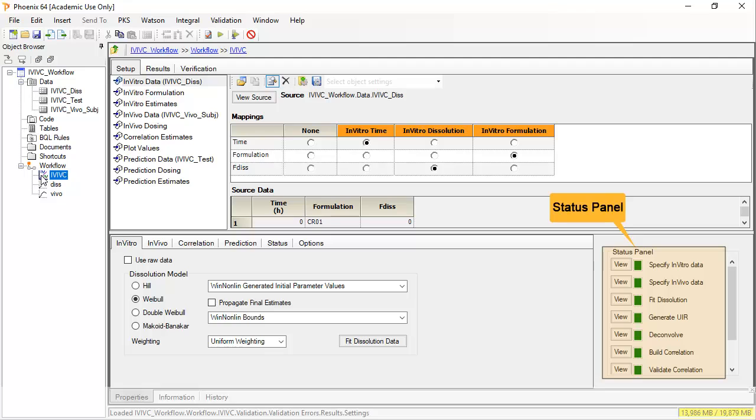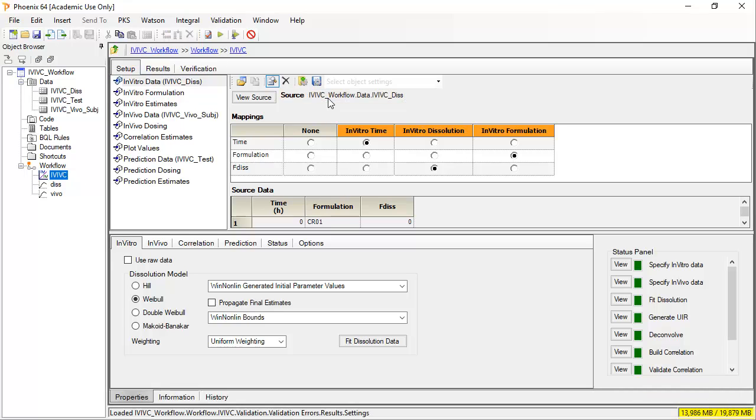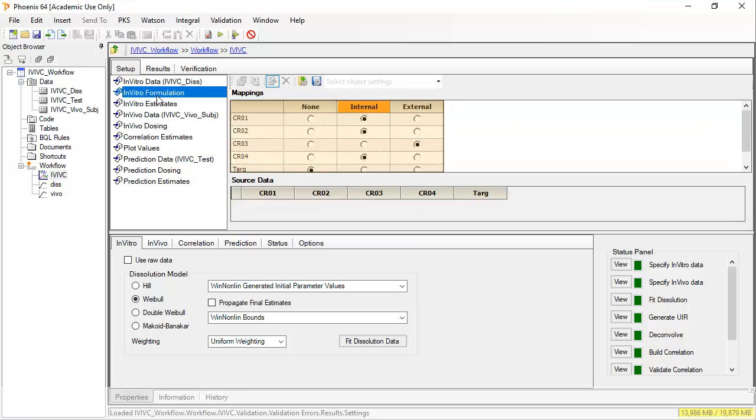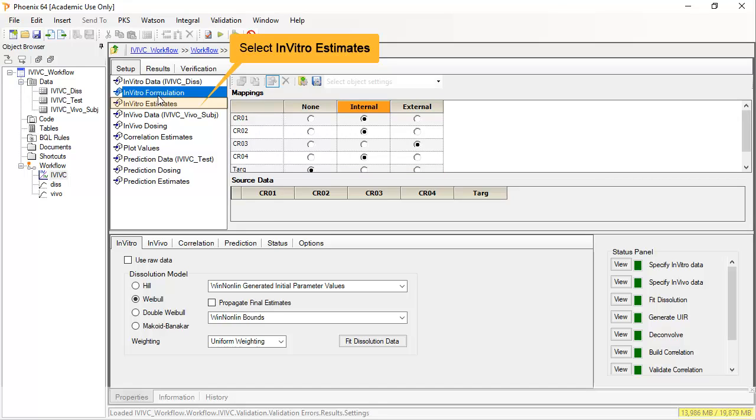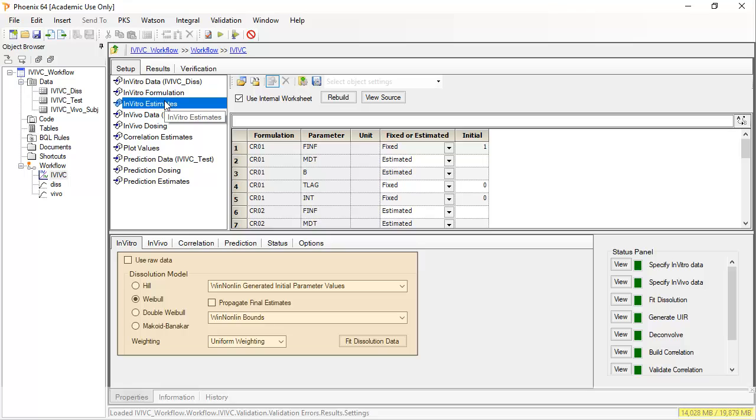That they are all green indicates that all the correlation steps have been run. Looking now to setup, we see several inputs that feed into IVIVC. The first three relate to dissolution. Currently the DIS worksheet is displayed and mapped. Let us look at the second input. Here you assign whether a formulation should be used for internal or external validation of the correlation model. A minimum of two forms should be mapped to internal. The input, in vitro estimates, is related to the dissolution model chosen below. The IVIVC toolkit utilizes the least squares regression model engine throughout.